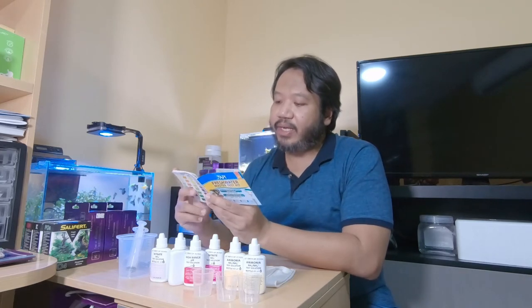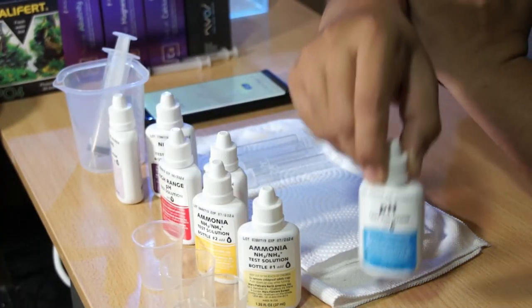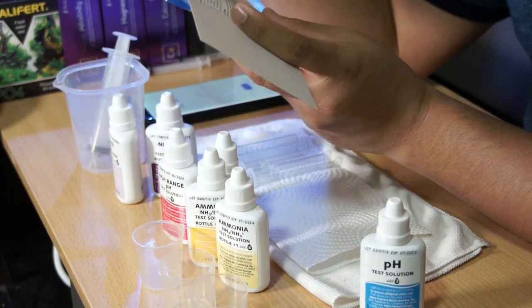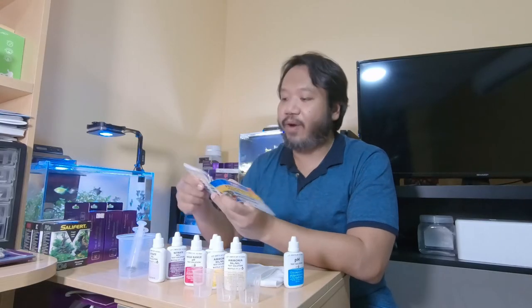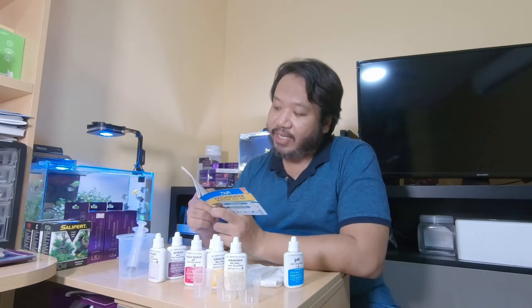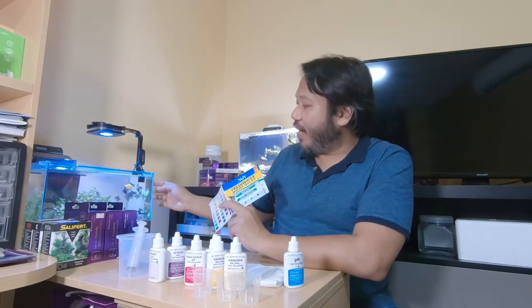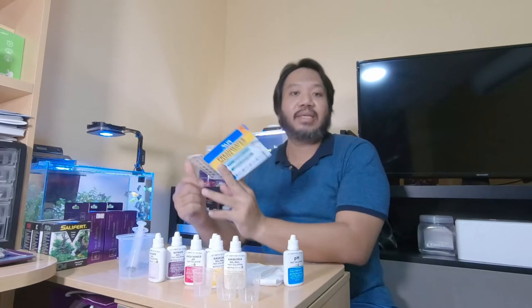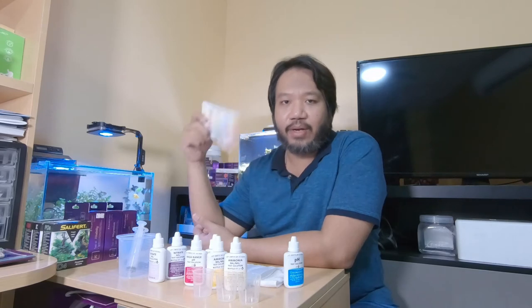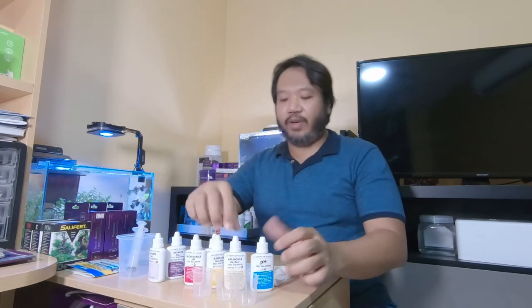For pH testing tips, the minimum reading is 6 and the maximum is 7.6 for the normal pH solution. The directions say to fill 5 ml of water to be tested, then add 3 droplets of the test solution. Recommended pH for a community aquarium is 7. Since I'm keeping plants, I try to get it up to about 7.6 to 7.8. I'll give exact parameters when I do the tank review. We'll go in order: normal pH, high range pH, ammonia, nitrite, then nitrate.